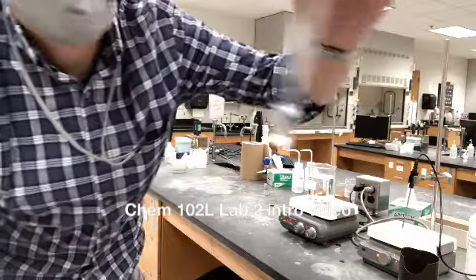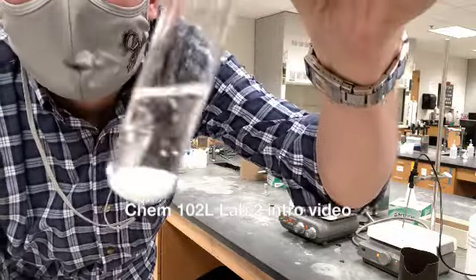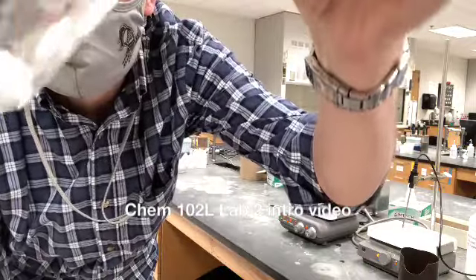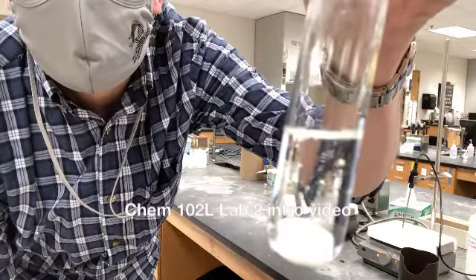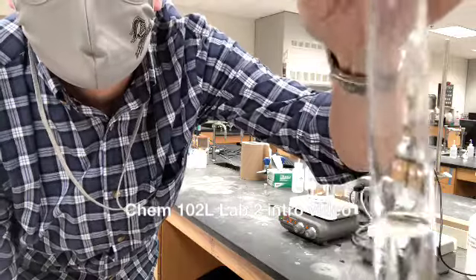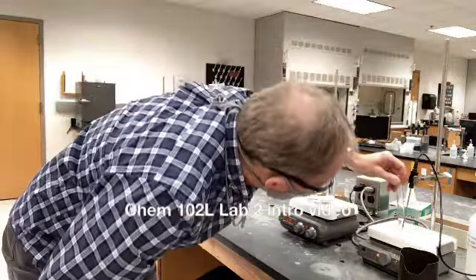One of the challenges in my research projects is that we're trying to dissolve something that's not very kindly dissolved in water, and we're trying to make sure that it's completely dissolved. So this is pretty good. It's got a few particles floating around in it a little bit. A little bit of stirring might be all that's needed.